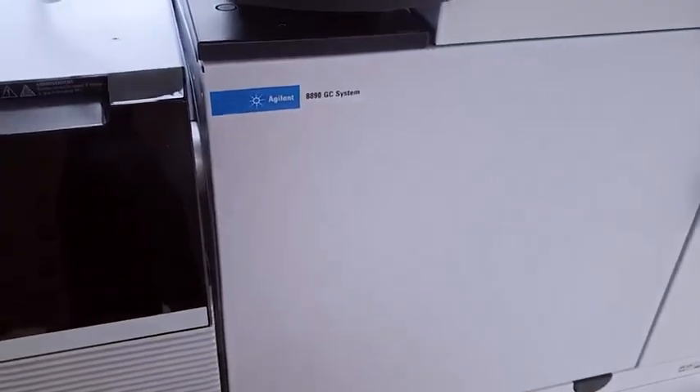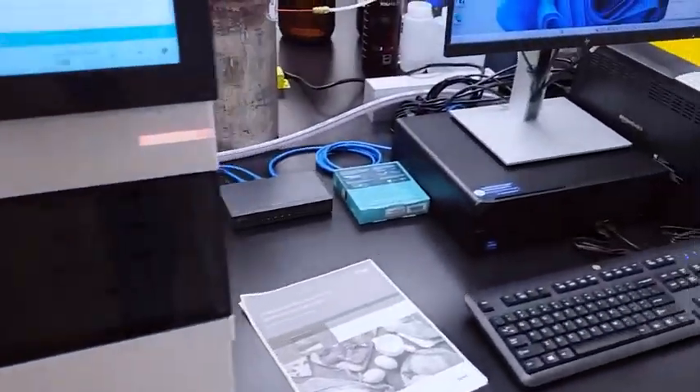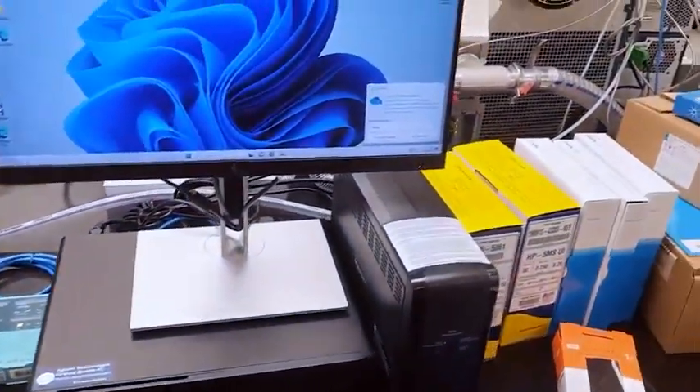I'm going to spend quite a few days here with a trainer to learn this instrument — how to do maintenance, how to set up and run methods on it. Then we're going to start running dioxin testing, and we'll add that to our lab's routine testing, which currently includes heavy metals, glyphosate, and microbiology.